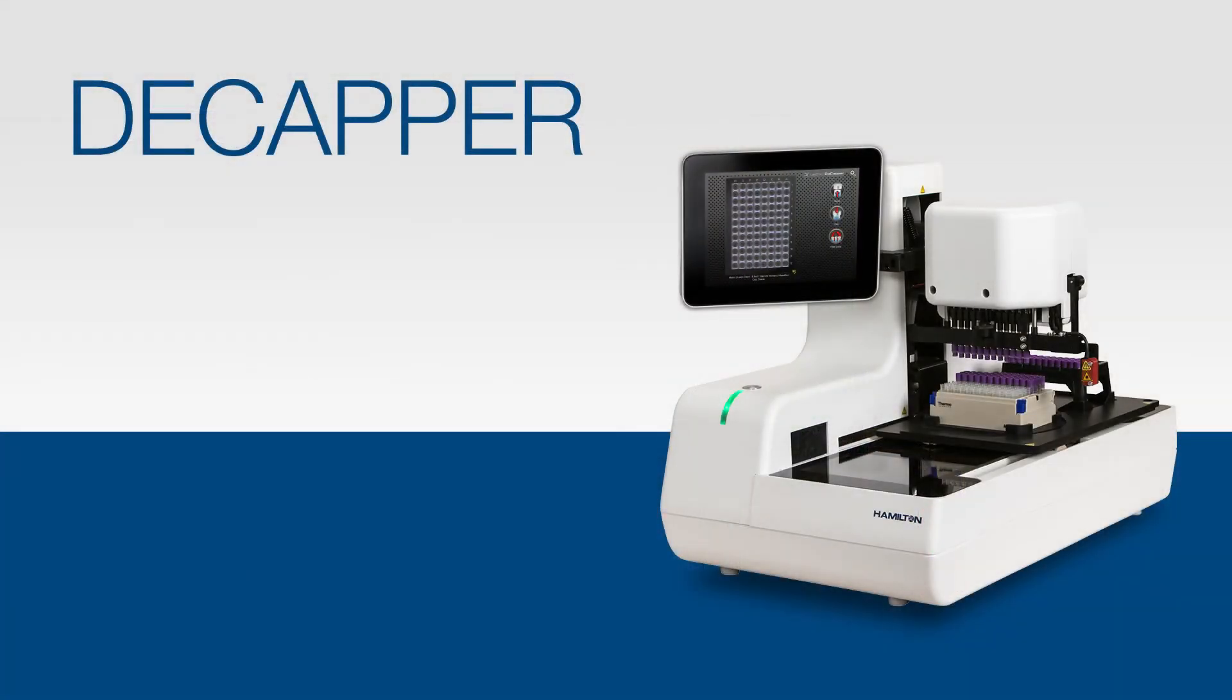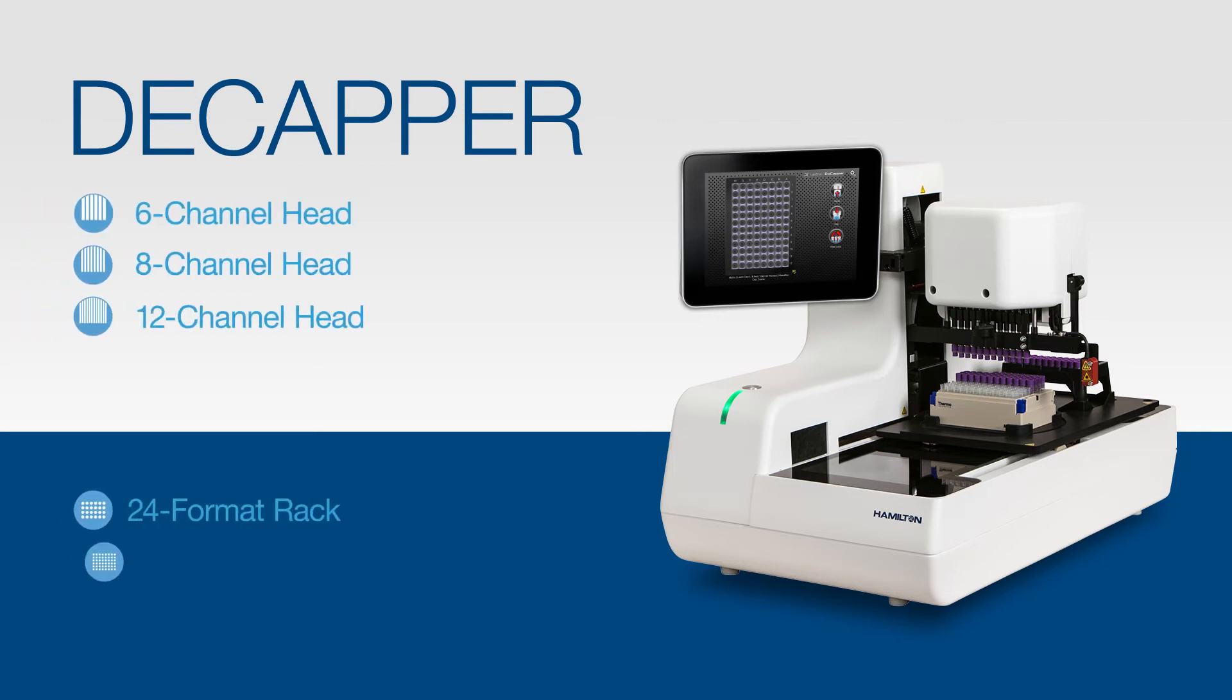Let's review the components of the Decapper. The base contains the majority of the electronics that operate the instrument. We offer 6, 8, and 12-channel heads to support 24, 48, and 96-formatted labware. There is actually firmware in the head as well. So, for example, when you have a 6-channel head on the machine, it's only going to recognize 24-format labware choices.